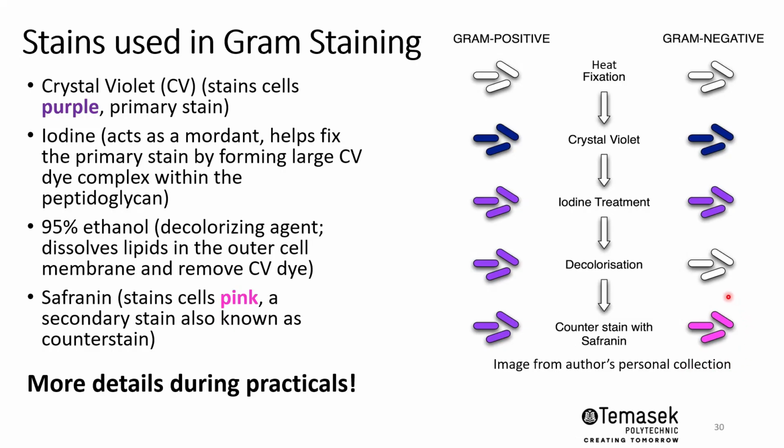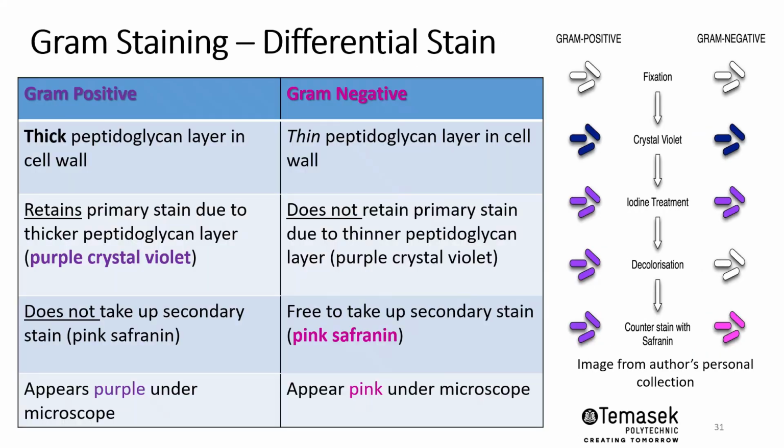More details during the practical, you'll be doing gram staining, so keep a lookout for it. I just want to emphasize the difference in the gram-positive and gram-negative bacteria. Gram-positive bacteria have a thick peptidoglycan cell wall. In contrast, the gram-negative bacteria have a thin layer.